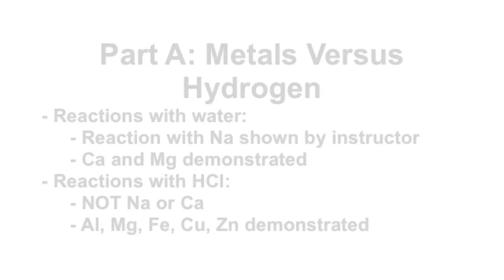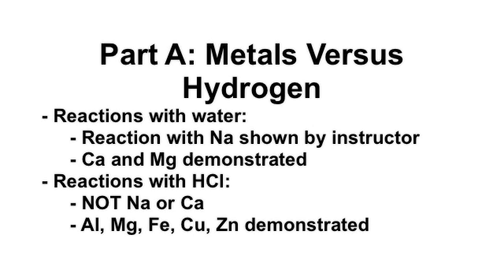In this video, we will demonstrate the Activity Series experiment. In Part A of this experiment, we will demonstrate the reactions of metals with water. Sodium will be shown to you in lab. Calcium and magnesium will be demonstrated here.